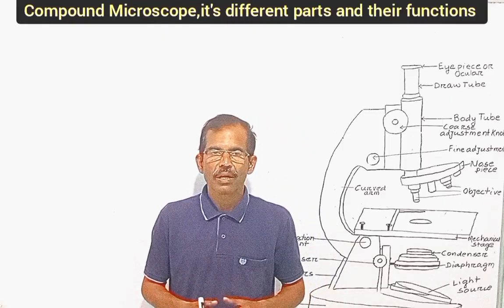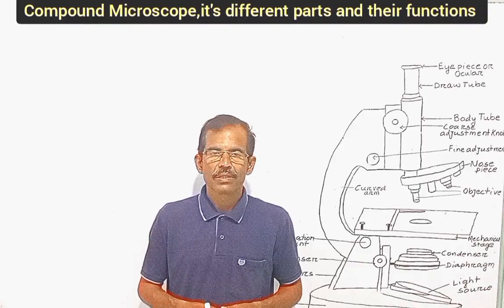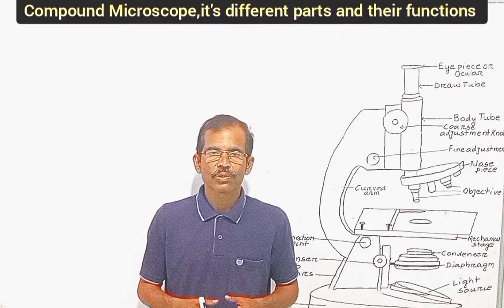Today we will come to know what a compound microscope is, its different parts and their functions.